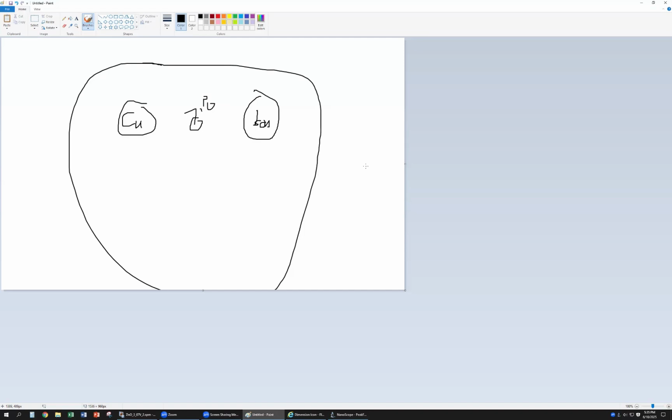So one time for one component, for accuracy. I first calibrate with the hard probe and scan the hard component for one image, then change to the soft probe, calibrate again, and scan the soft component for the second image. You cannot cover everything at one time because of different probes. The probe is quite important.